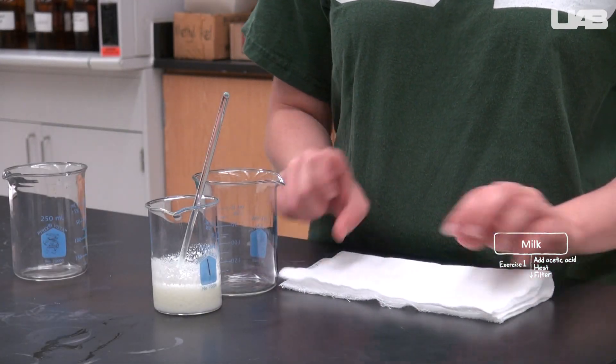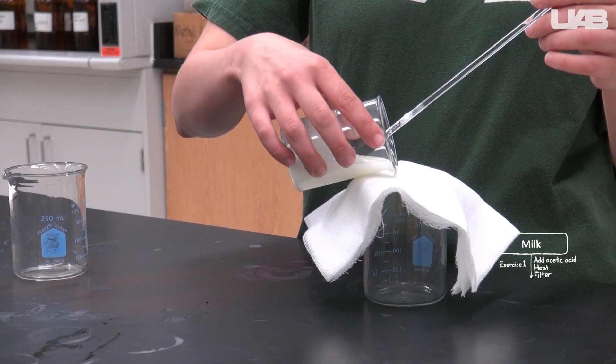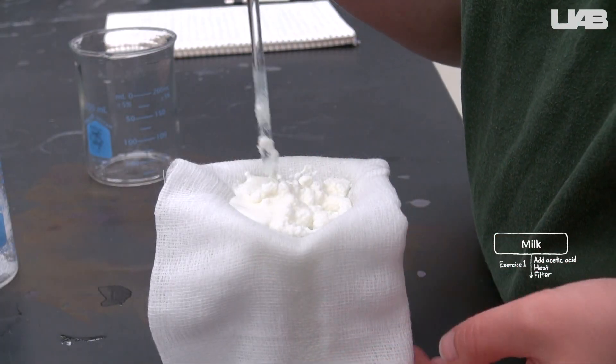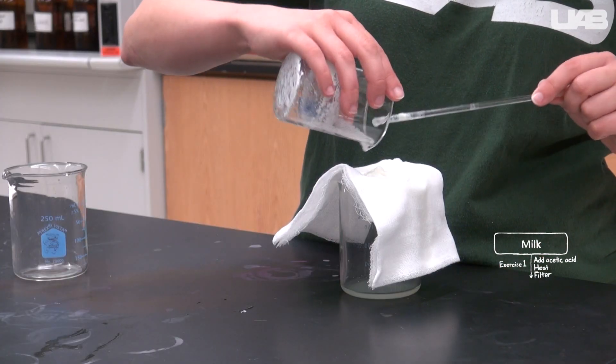Fold a piece of cheesecloth several times and place it over the beaker. Pour the mixture through the cheesecloth to separate the liquid from the solid protein and fat. You can use the stir rod to encourage more of the liquid to go through. Try to get everything out of the beaker.